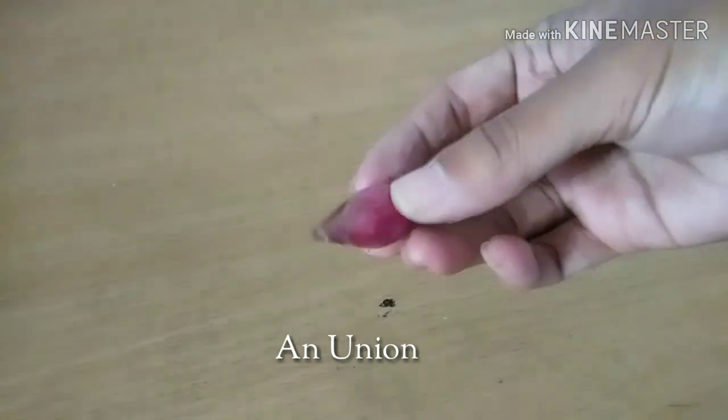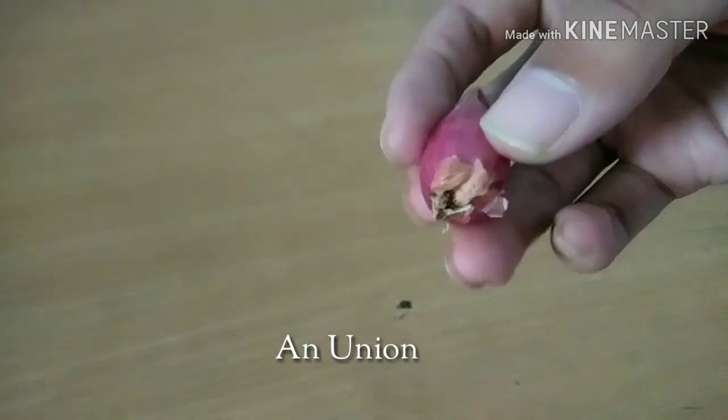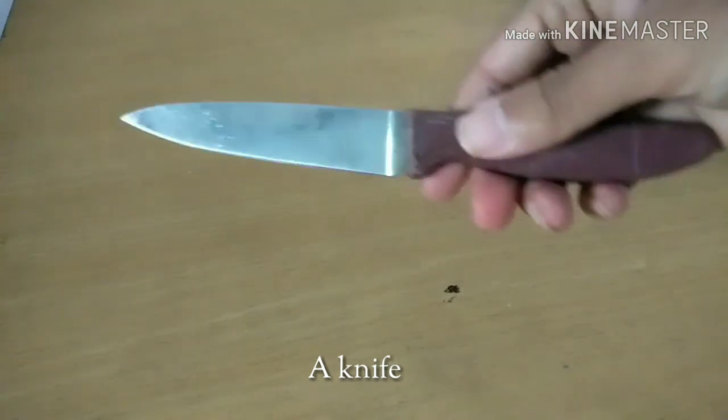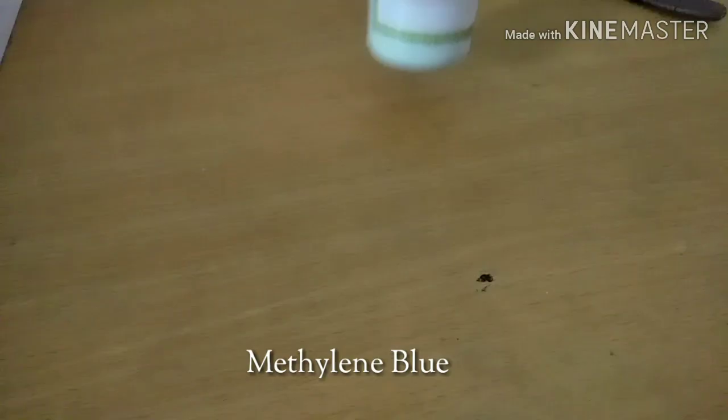An onion, as a sample that we use for observing. Seven, knife, to slice the onion. Eight, methylene blue, used for coloring the object.